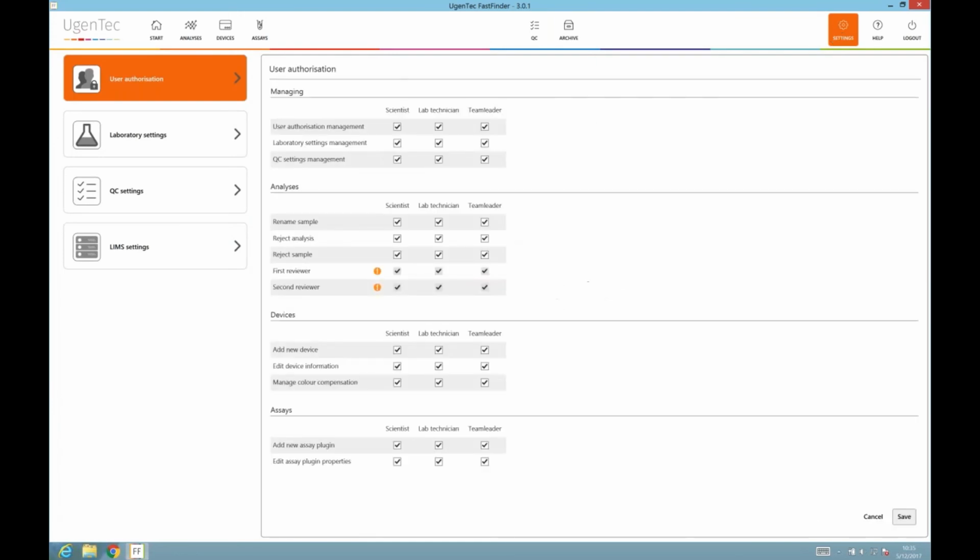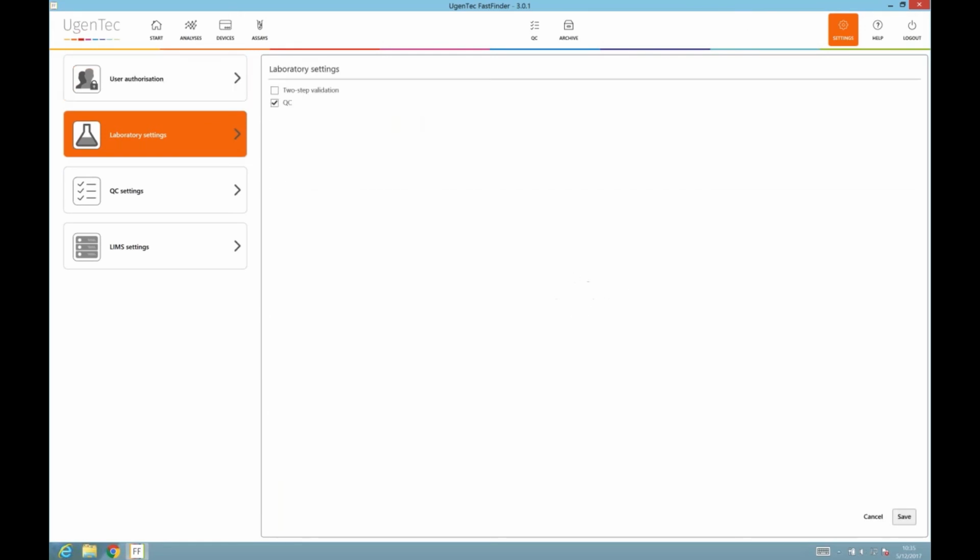And coming to the end of our demonstration, I'd again just like to emphasize that all of this information is essentially managed by the end user. So again, we're not handing down a given workflow, because the actual software is designed to be controlled by you and to fit flexibly into your laboratory workflow. Okay. Back to you, Thomas.